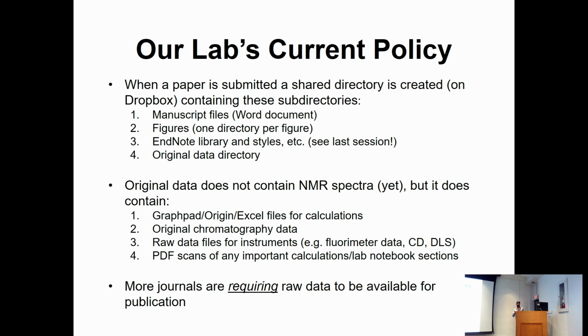With all of that, we have everything in a certain place, so it's easy to handle, and whenever it's time for submission, it's easy to work with. Most of the journals sometimes require raw data to be available for publication. So we don't need to worry about that when we do the submission, because we are ready with everything.